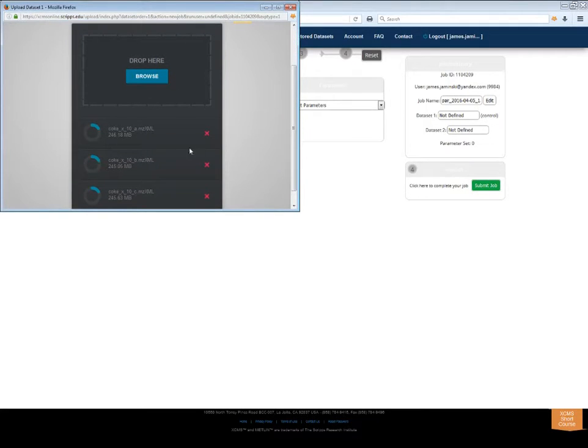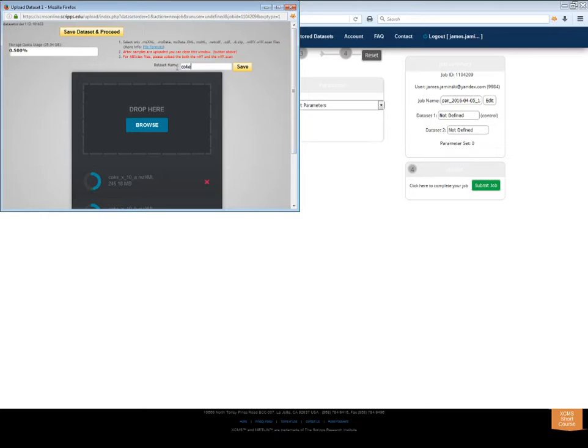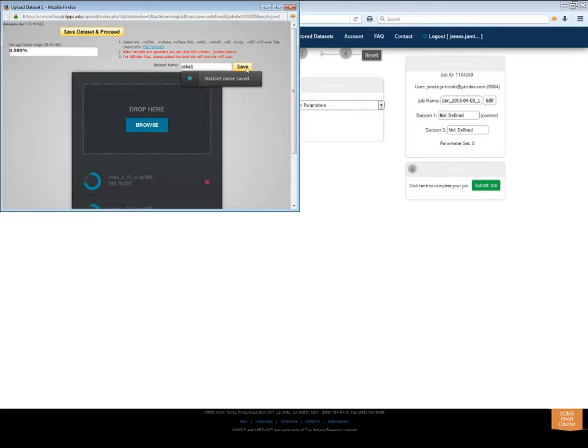XCMS Online will automatically create a generic name for your dataset. You can use this time to rename your dataset in the upload window, or in the wizard after the upload completes. Do not close the window until all the files are successfully uploaded, or you will lose the data and have to re-upload it.